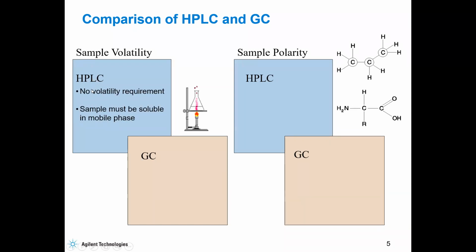In HPLC, you don't need any compound to be volatile. Volatility is not required.